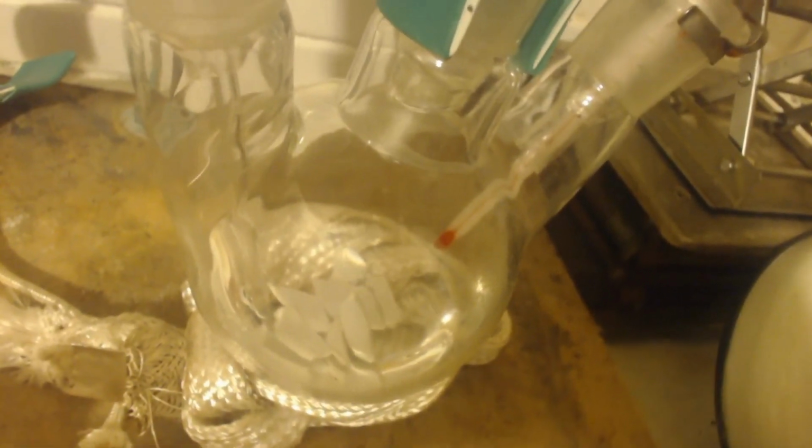Okay. And I looked it up, and DCM boils about 39.6 Celsius, and tetrachloromethane boils at 76.72 degrees Celsius. So, you know what I mean? If it's working, the boiling temperature will start rising as I go.